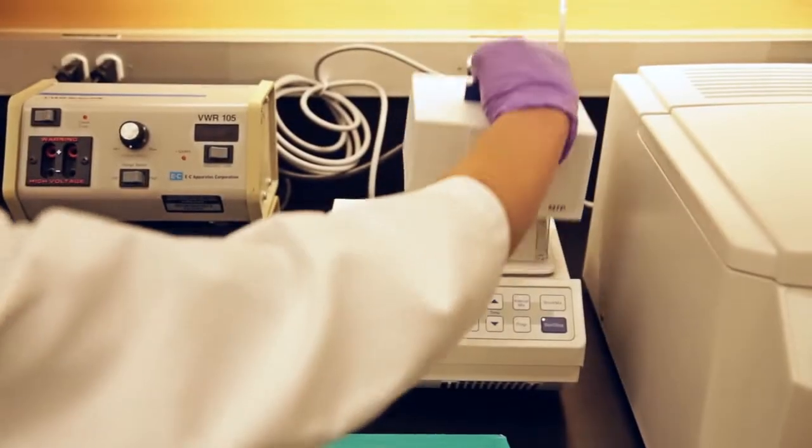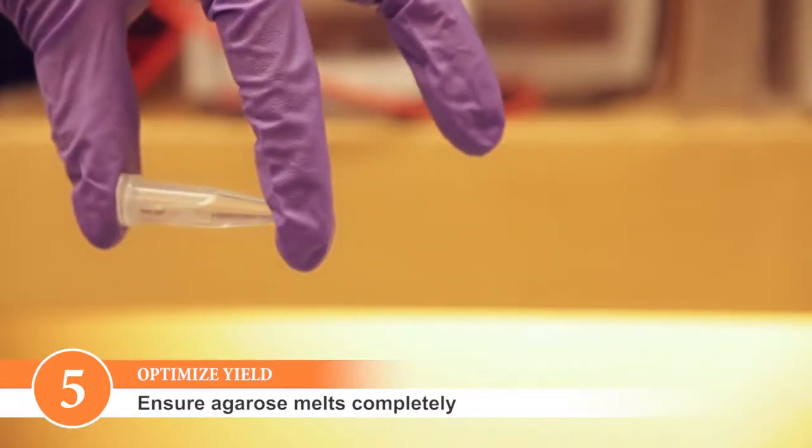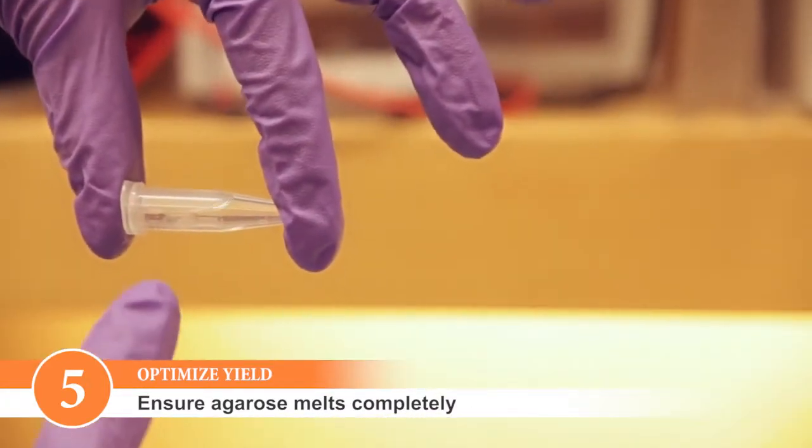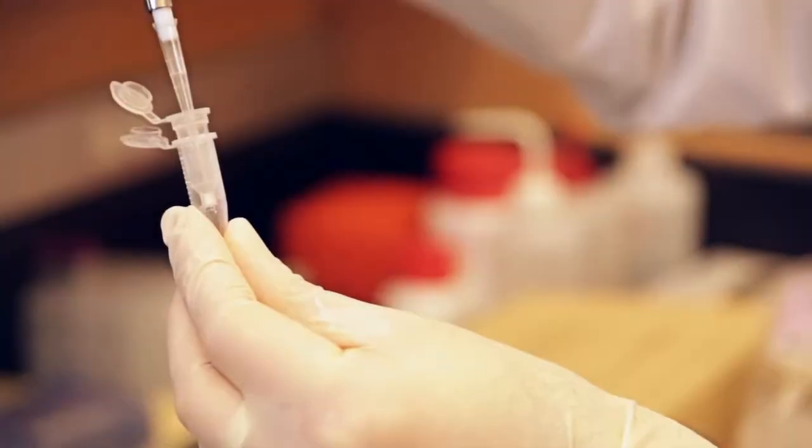Make sure that the agarose is completely melted before loading the sample onto the column. Undissolved agarose still containing DNA will result in lower yields and may also clog the column.